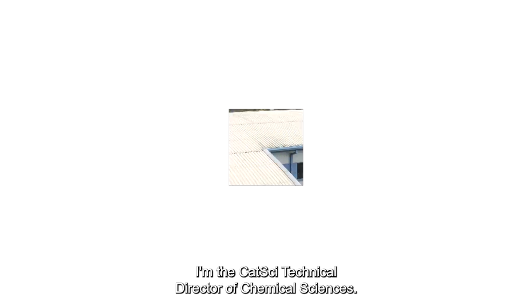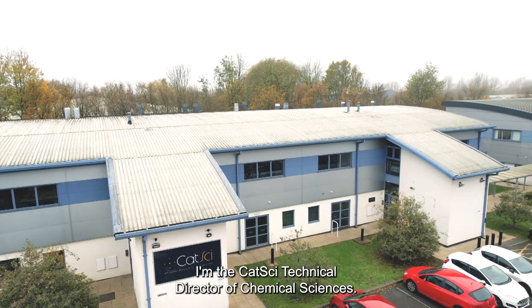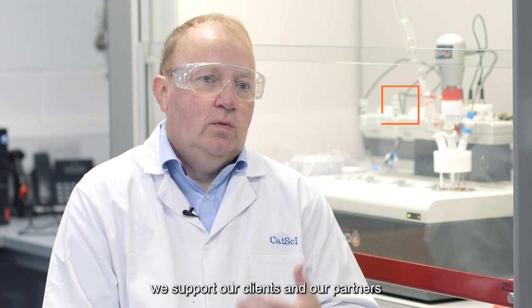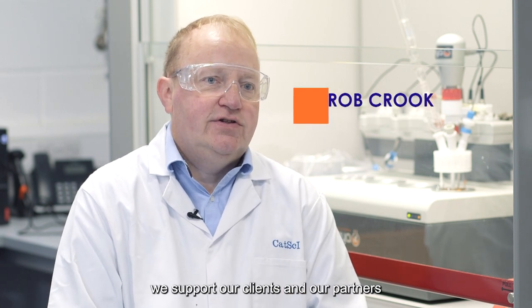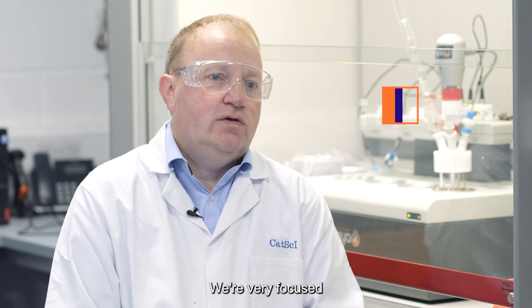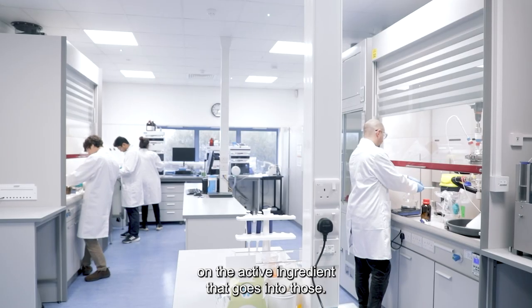I'm Robert Crook, CATSI's Technical Director of Chemical Sciences. CATSI is a small chemical research organization. We support our clients and partners in delivering pharmaceuticals to the market. We're very focused on the active ingredient that goes into those.